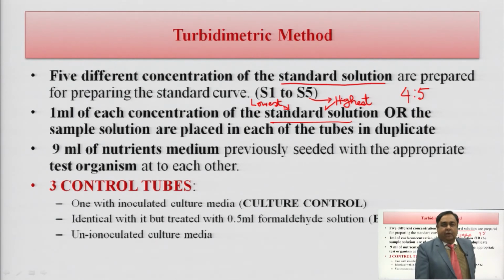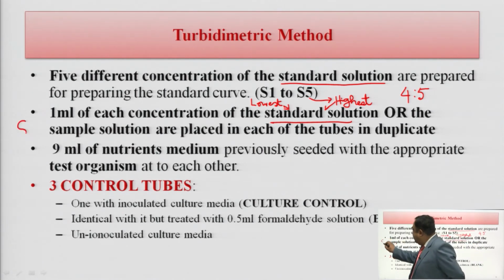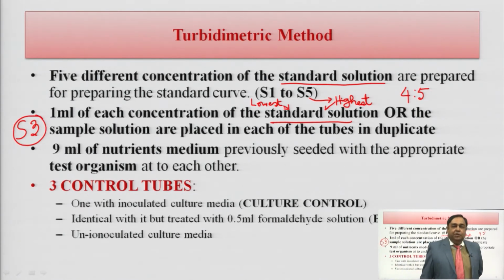Taking that to be 100% true, you prepare a solution which is equivalent to the S3 concentration of the standard solutions.